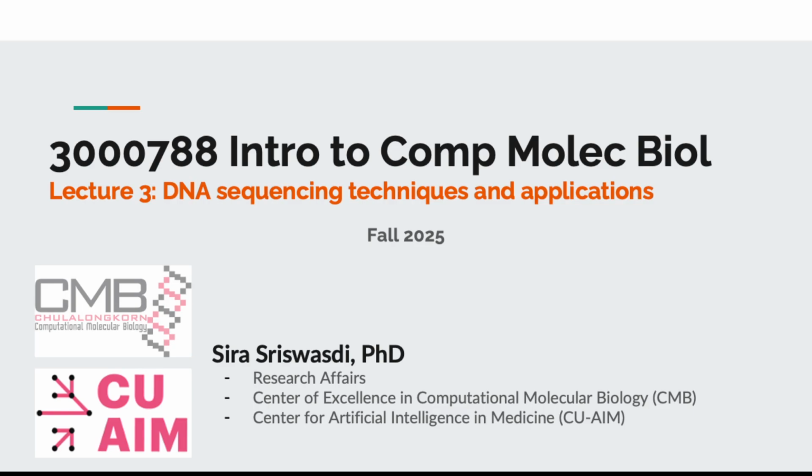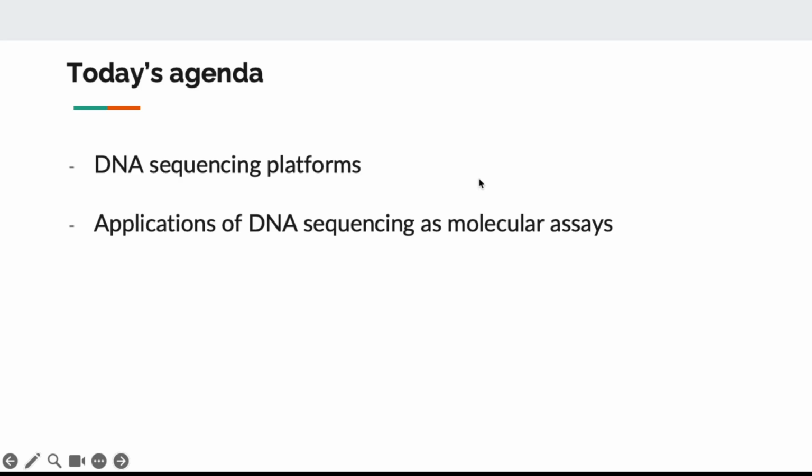Okay, so today's objective is simple. We will talk about DNA sequencing platforms, what they are, what their pros and cons are, and then we will look at some of the applications that use them in biology.